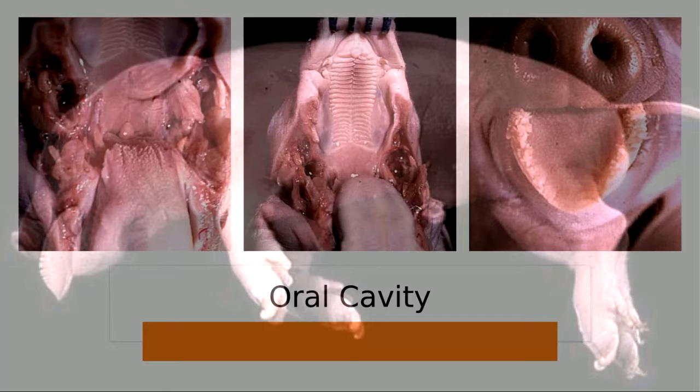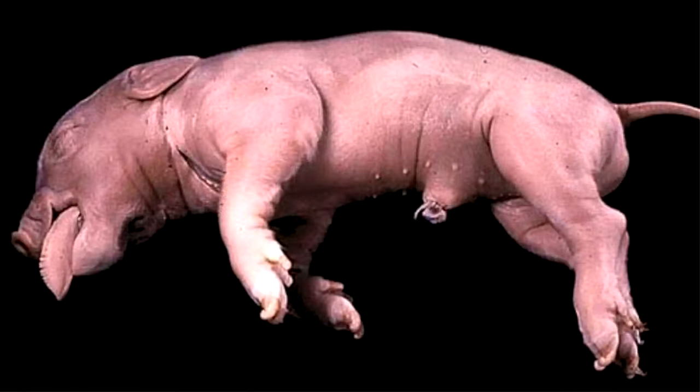I just remembered something else here. The other thing you would be asked to do is to take a look at the eye. If you open it up, let me see if I can draw it. Here's the eye. Here's the pupil. And then it would have a white membrane.